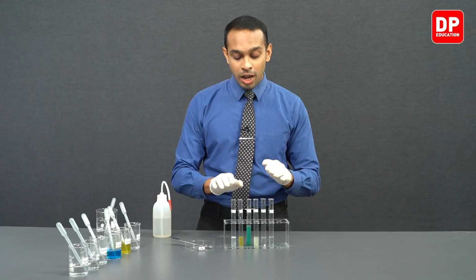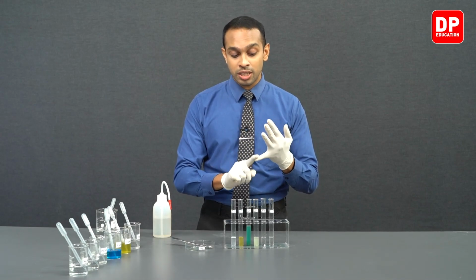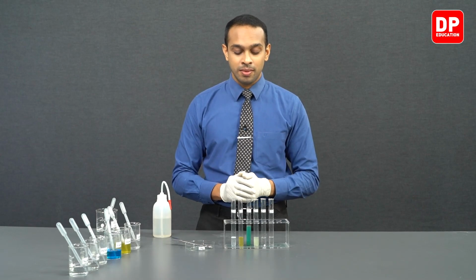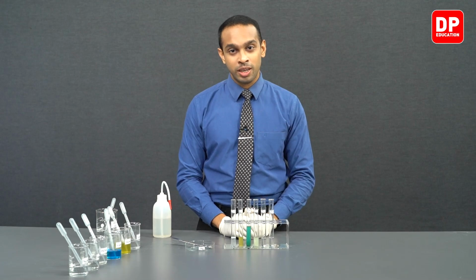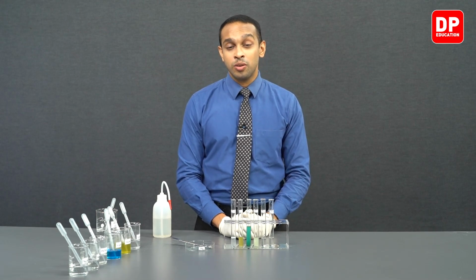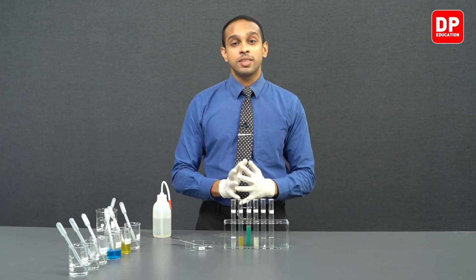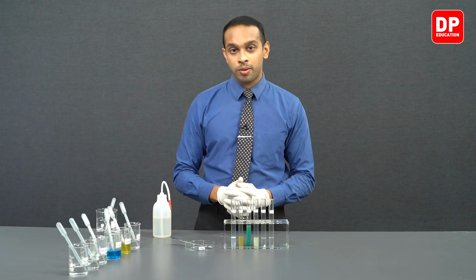Magnesium was more reactive than zinc, iron, copper, and lead. However, sodium was more reactive than magnesium. That is why we didn't observe a reaction with magnesium and sodium 1+ ion solution. After making note of that, we can now move on to the fourth part of our experiment.